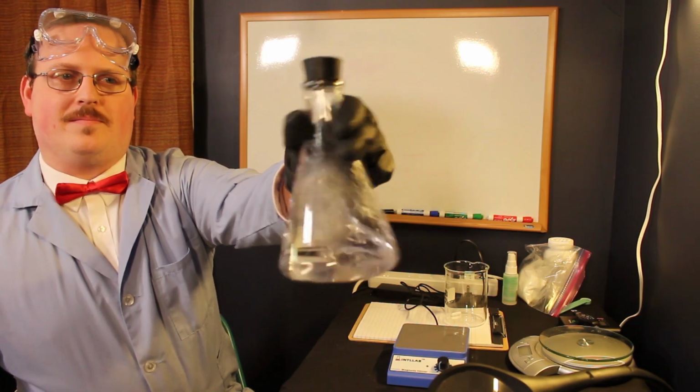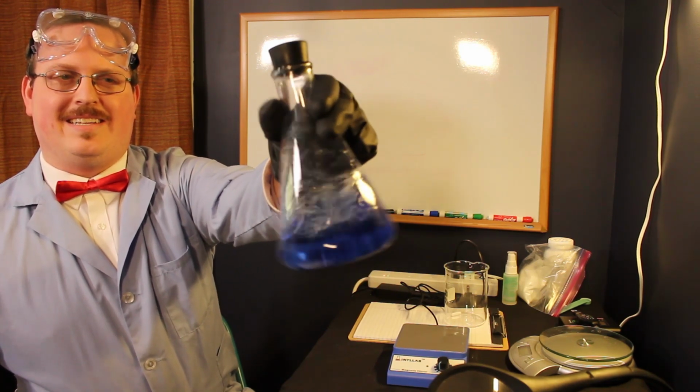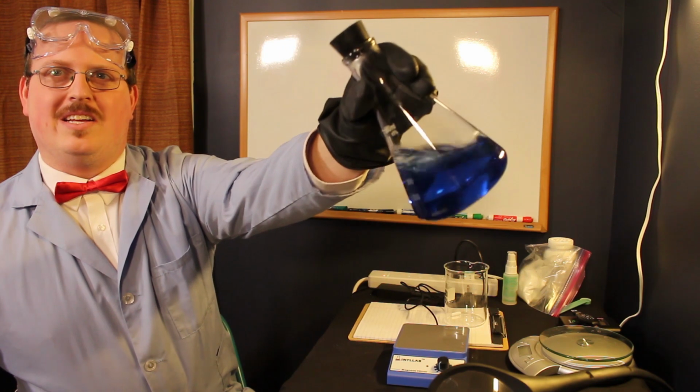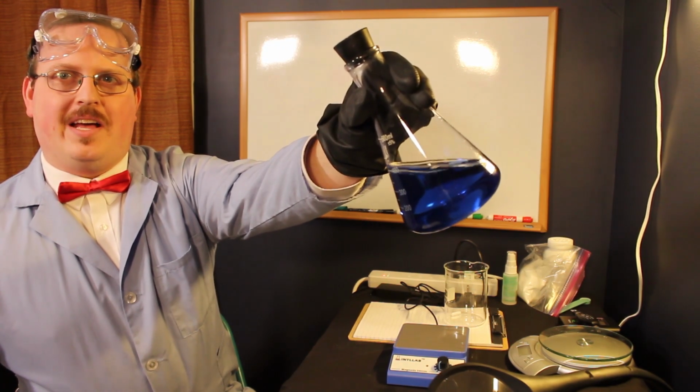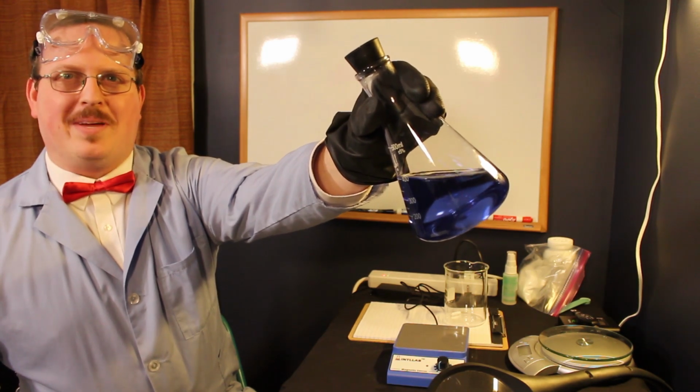Look closely. So take a look at that change. It's changed from colorless to a deep blue. So what happened here?